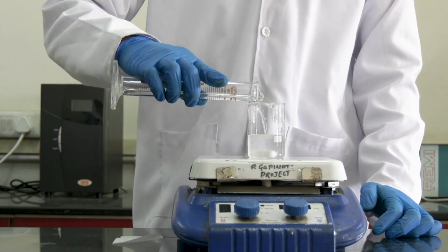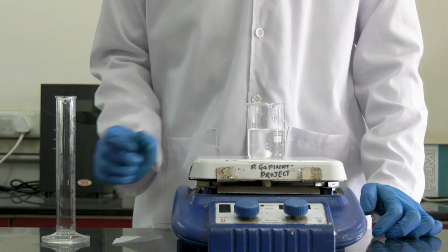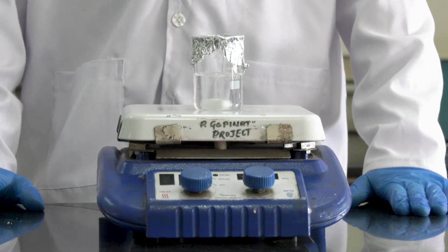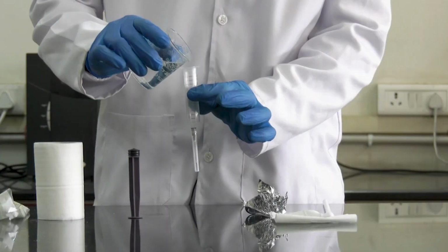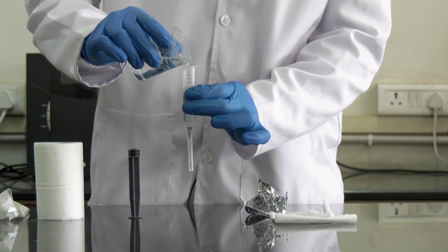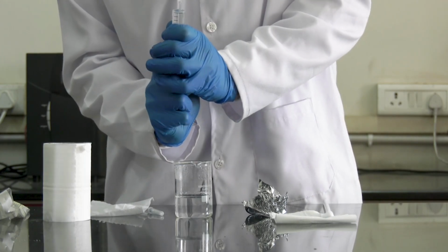After a while, add the remaining water. Let the solution stir until the polymer is completely dissolved. Once the polymer is dissolved, carefully pour the solution into the syringe. Make sure there is no air gap in the syringe.